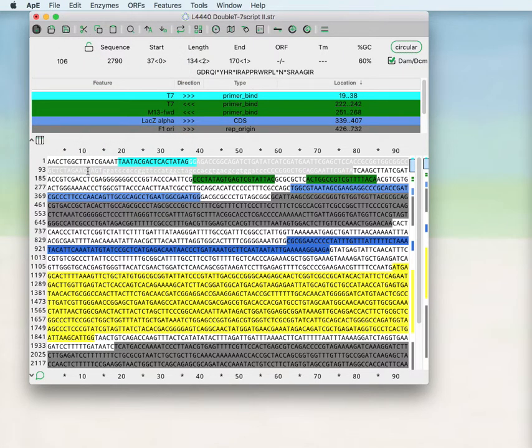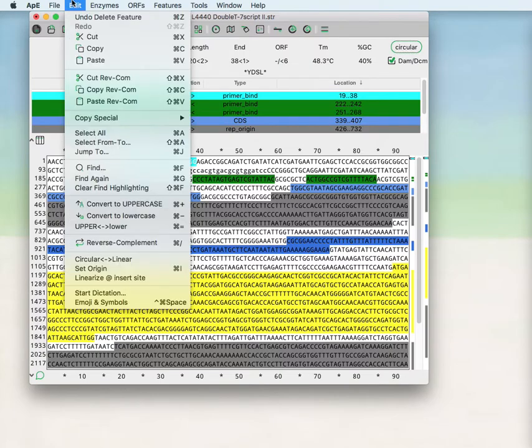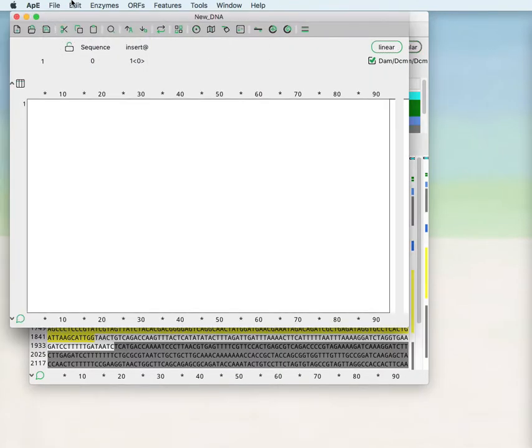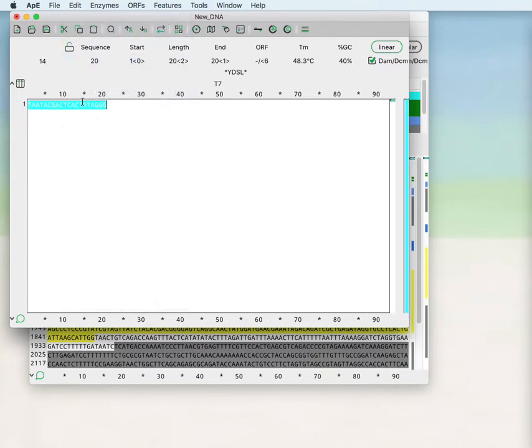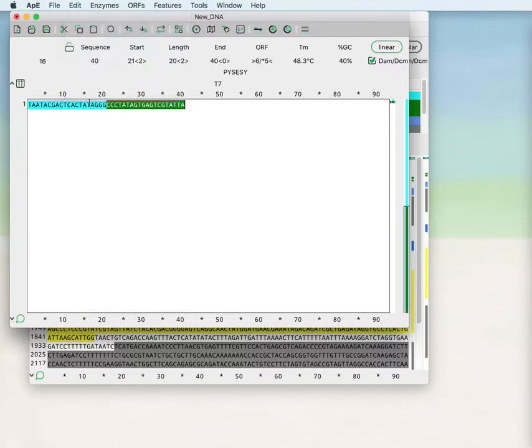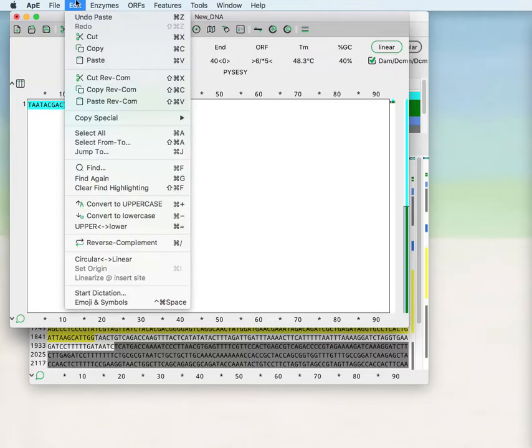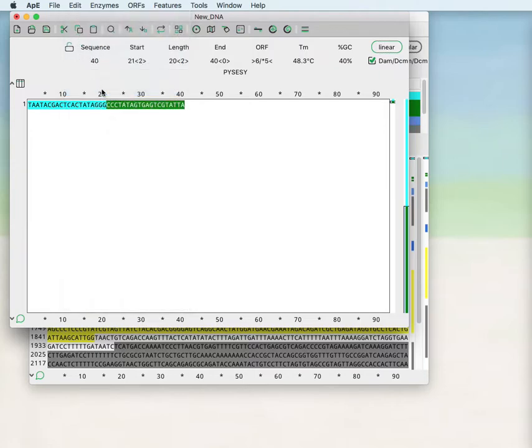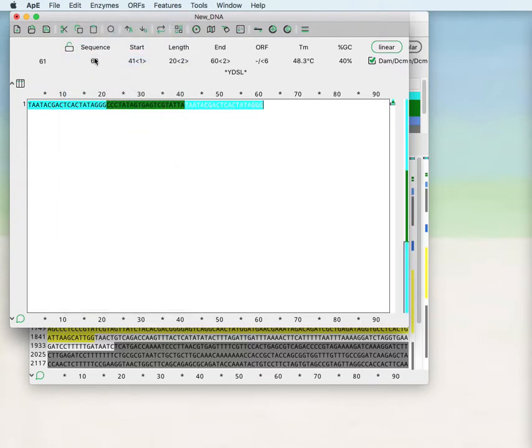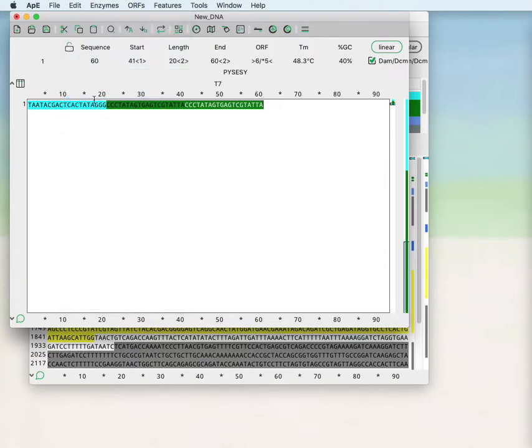So if you copy this feature here, you can paste it in the forward orientation or you can paste it in the reverse orientation. The same as copying, you can copy in the reverse orientation, then paste, or paste in the reverse complement.